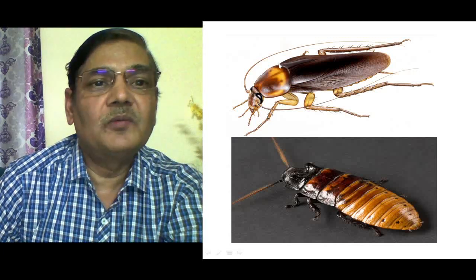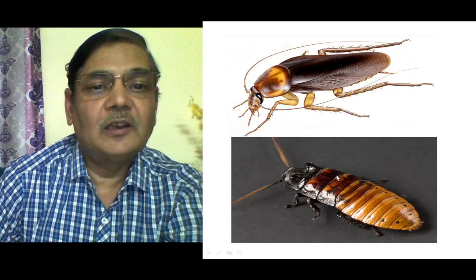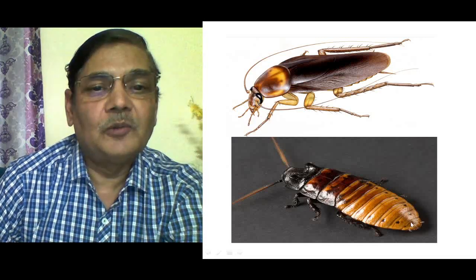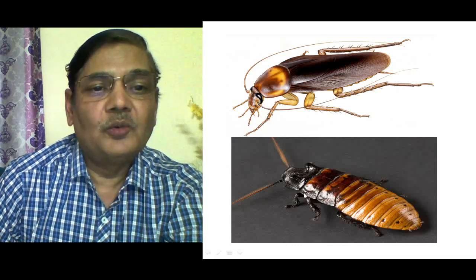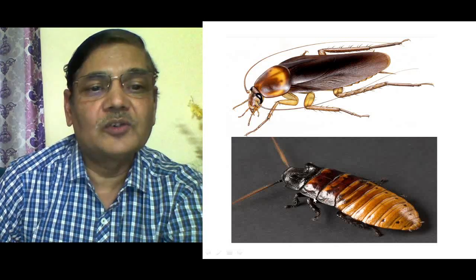So you remove the wings with the help of scissors, and then the dorsal portion looks very clear, means you can see the different segments of its abdomen, and also the thoracic portions become very clear. And after removing the wings, you make a very thin cut on the lateral side of this animal, including its thorax and abdomen, means thoracic and abdominal portion.